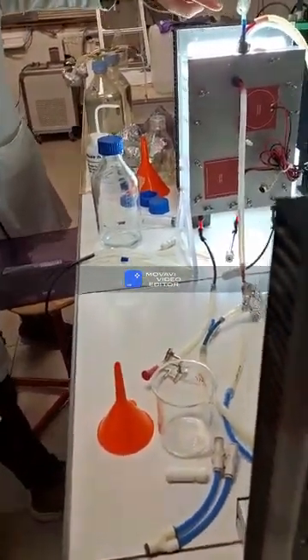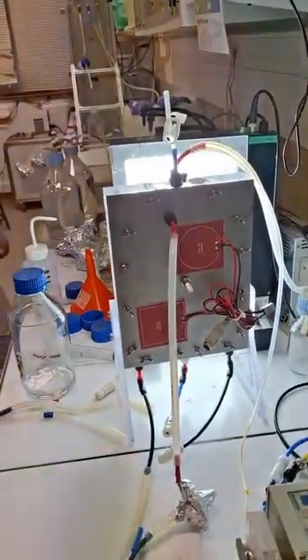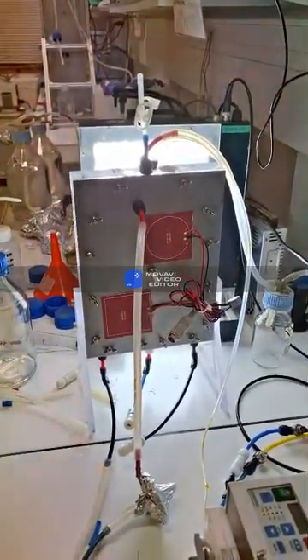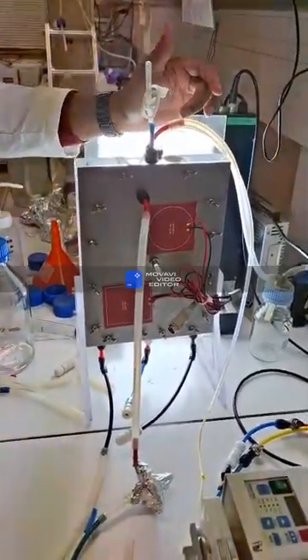What does this mean? Sampling, to take out a sample. Every day you will sample the culture to monitor the growth of the microalgae.